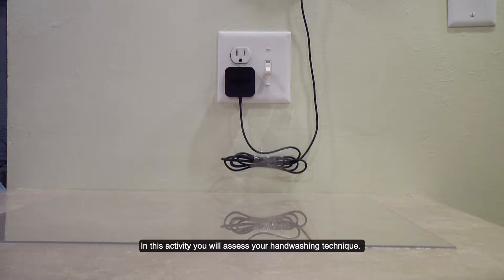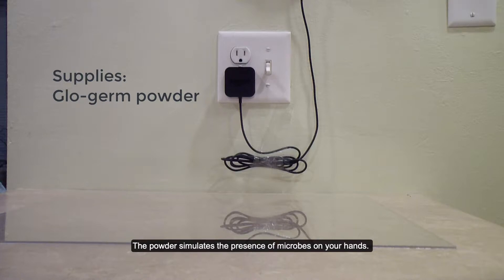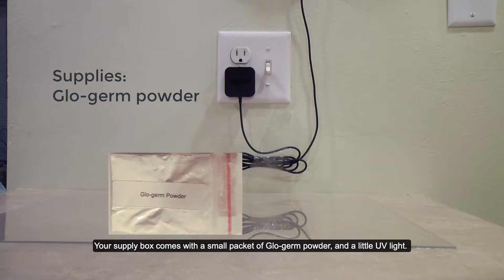In this activity you will assess your handwashing technique. You will use glow germ powder, a commercially available powder that fluoresces under ultraviolet light. The powder simulates the presence of microbes on your hands. Your supply box comes with a small packet of glow germ powder and a little UV light.